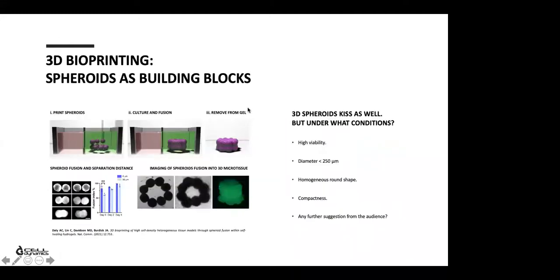And as far as it concerns 3D bioprinting, one of the recent trends is to use stem cell derived spheroids as building blocks instead of cells embedded within hydrogel, as we do normally. And tissue spheroids can be assembled into macro tissue through this tissue fusion process. New fabrication tools are under development to control this fusion of the spheroids through the direct placement of these spheroids in close proximity. But moreover, new technology to characterize and standardize this spheroid production is also needed.